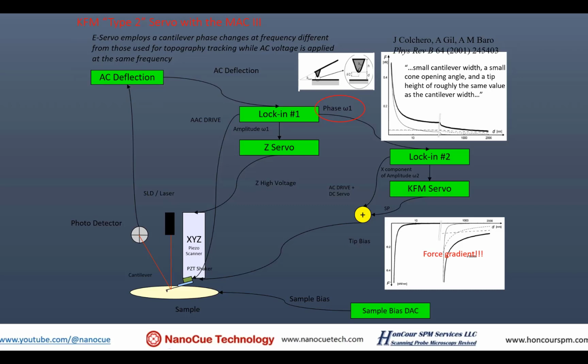I think one of the earlier images that I remember seeing was in a paper by John's colleague there, Sergey. Basically it was showing the mica, freshly cleaved, being exposed to the atmosphere, and all of the oils and stuff depositing onto the surface, and you could start to see the surface potential image changing.